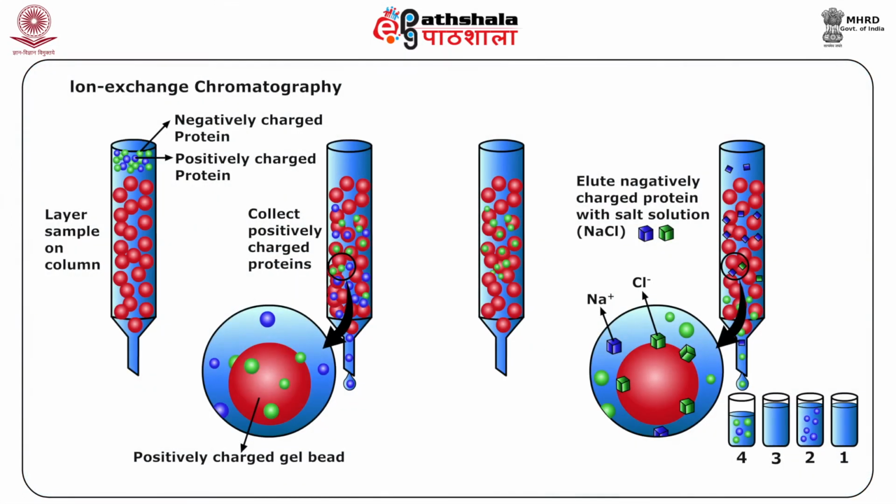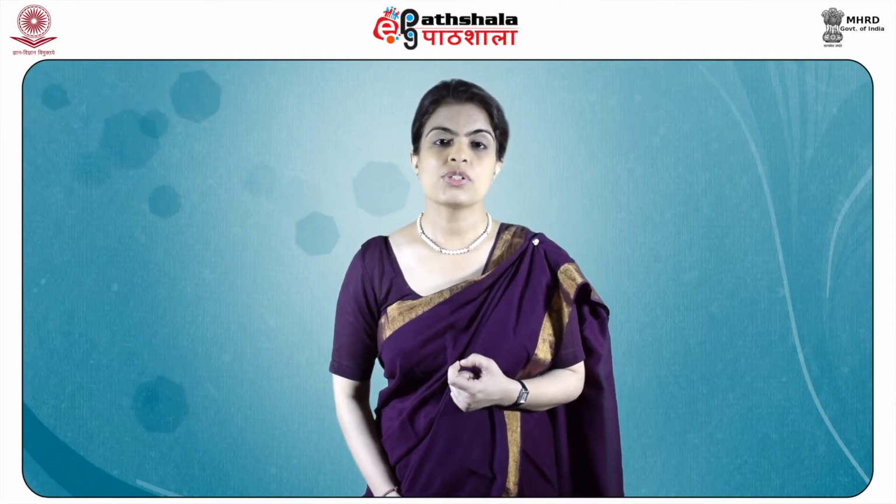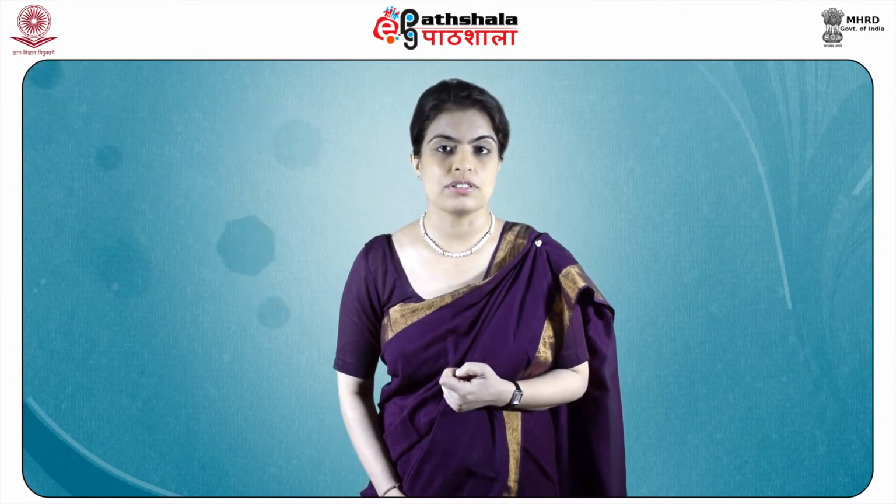For an anion exchanger, the cationic species in the sample mix will not bind and hence will be eluted first, followed by the anionic species. The diagram on the screen shows you how a negatively charged protein and a positively charged protein are separated on an ion exchange column. Cations will not bind to an anion exchanger and elute first, followed by the anions. The converse would hold true for the cation exchanger.